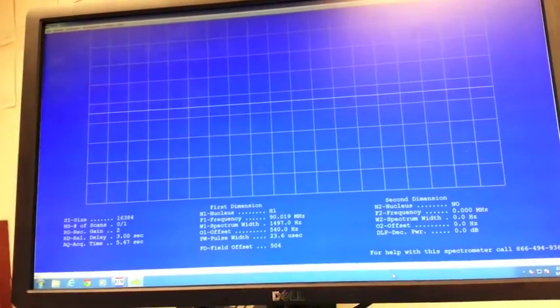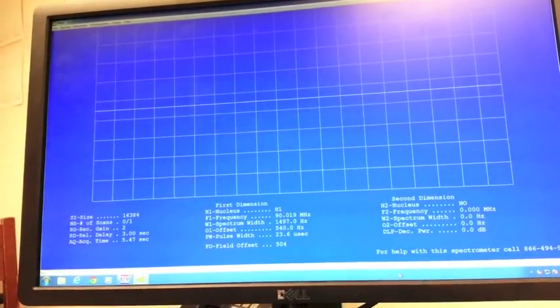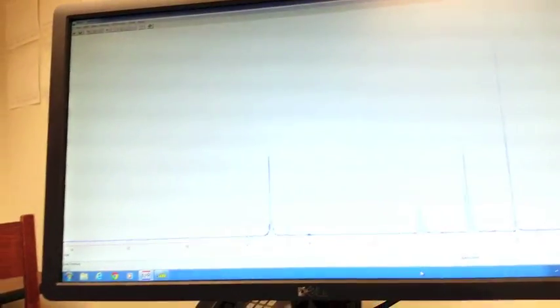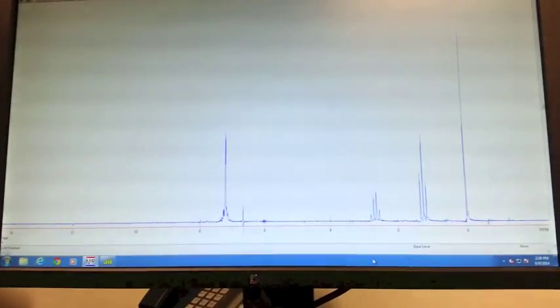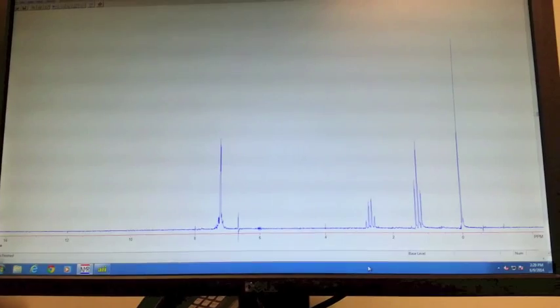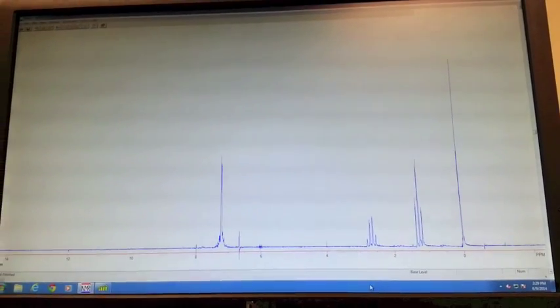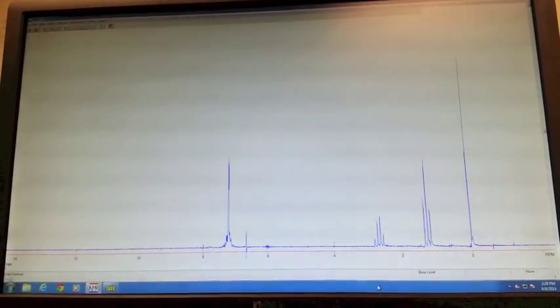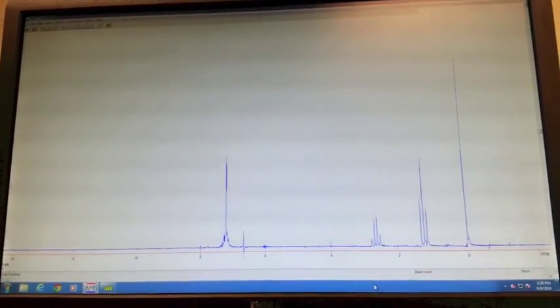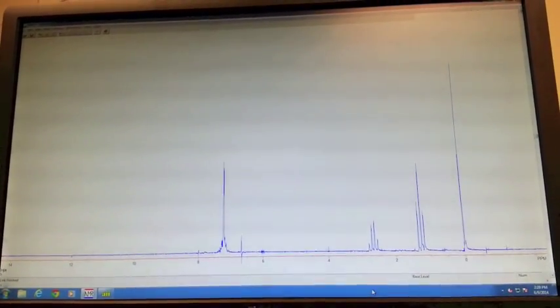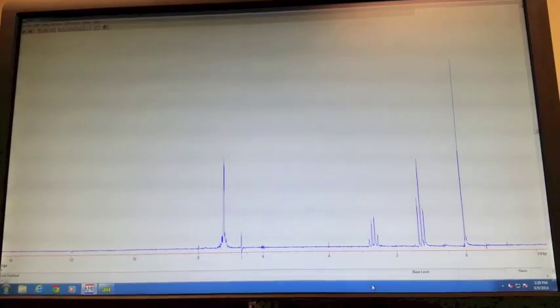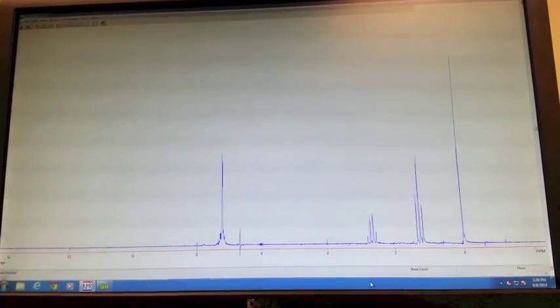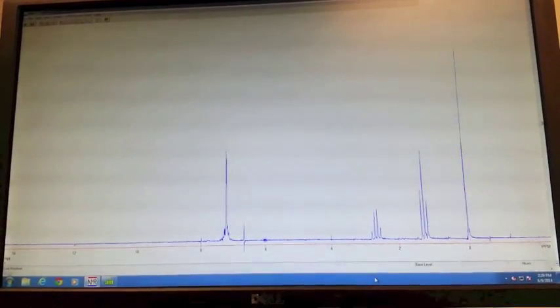The other program is NUTS. This is where you'll actually look at your spectrum and work it up. NUTS is a little bit different than PNMR. All the commands are two letters, and you don't have to hit enter to start them.